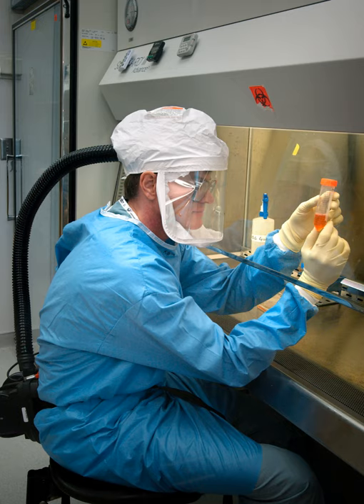This is in contrast to a laminar flow clean bench, which blows unfiltered exhaust air towards the user and is not safe for work with pathogenic agents. Neither are most BSCs safe for use as fume hoods. Likewise, a fume hood fails to provide the environmental protection that HEPA filtration in a BSC would provide. However, most classes of BSCs have a secondary purpose: to maintain the sterility of materials inside the cabinet.